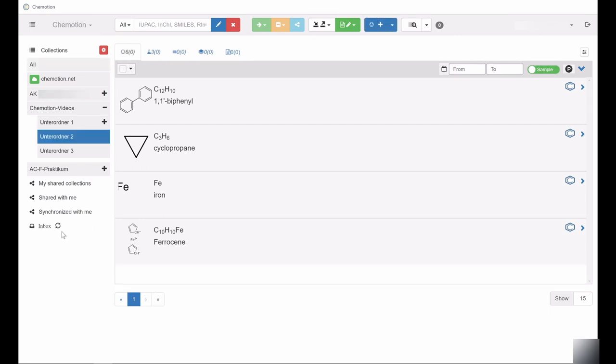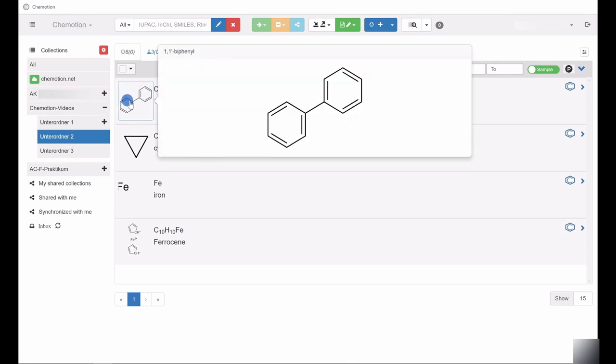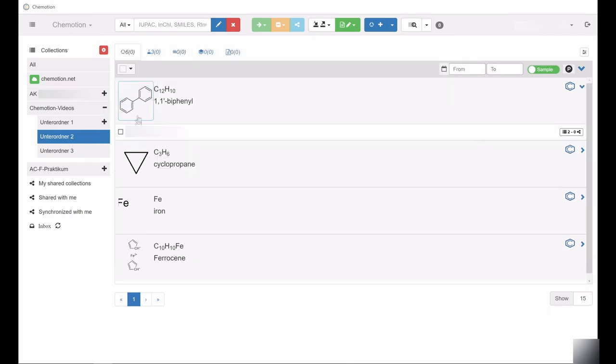The collection Chemotion.net allows you to transfer content directly from the Electronic Lab Journal Chemotion ELN to the Chemotion Repository.